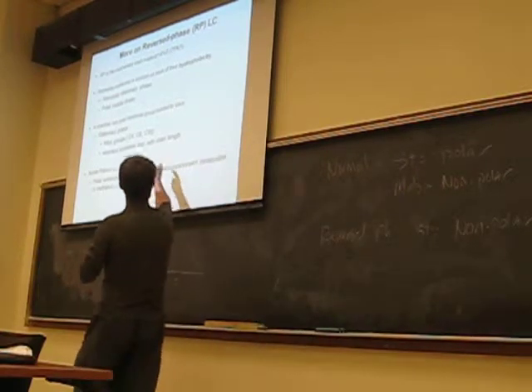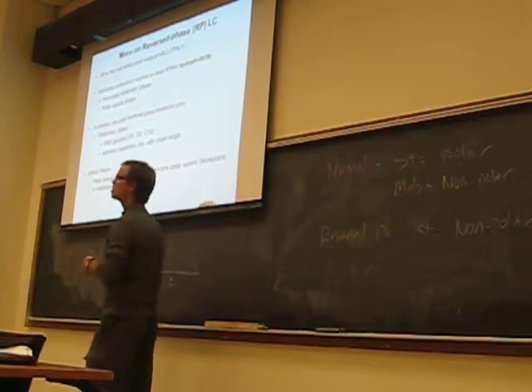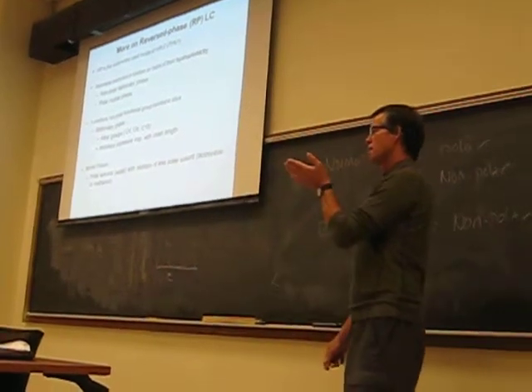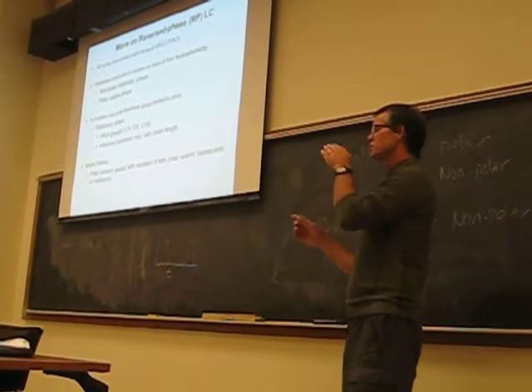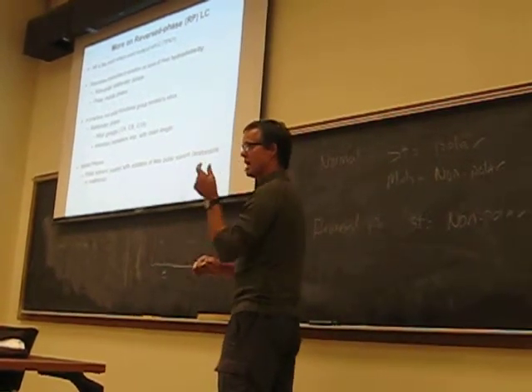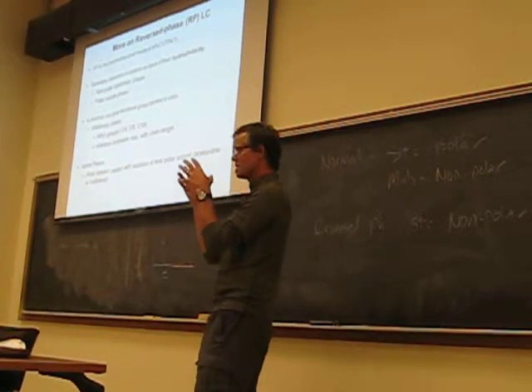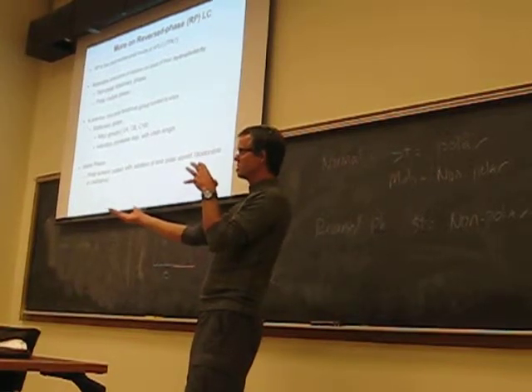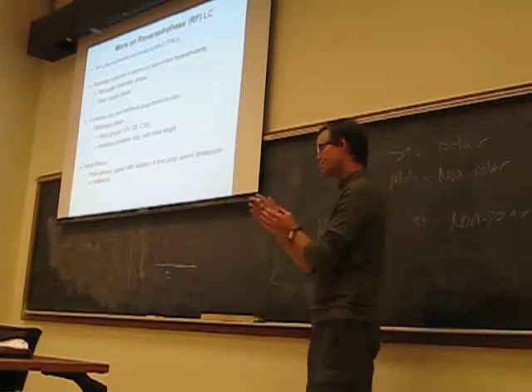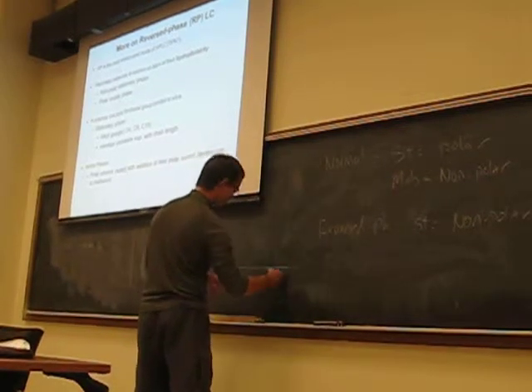In reverse phase, you're using this hydrophobic stationary phase in combination with a polar mobile phase. And that polar mobile phase is typically water, mixed with some degree of a relatively polar solvent, like acetonitrile and methanol or something like that. And it's that very interesting chemistry now, with the water and polar solvent mixtures of mobile phase with the nonpolar character of the stationary phase, that determines what gets partitioned or separated. And I'll get to this right near the very end. In most cases of chromatography, they're using reverse phase.